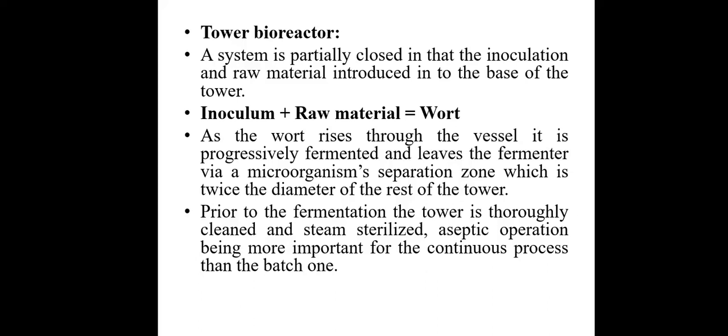Aseptic operation is more important for the continuous process than for the batch one. Whenever we are carrying out the continuous fermentation process, there is continuous addition of the inoculum and the raw material. For that purpose, proper sterilization of the material is important to avoid any type of contamination which may contaminate the product.